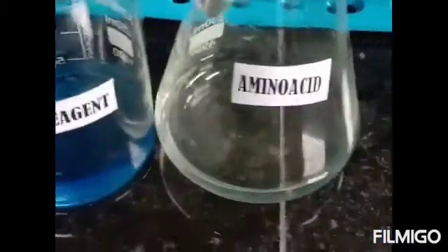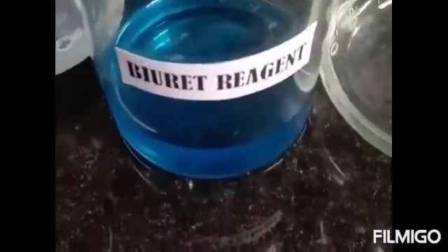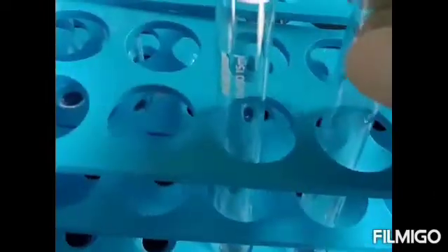We have taken 1 percentage protein and 1 percentage amino acid. Protein obviously gives a positive Biuret test, while amino acid is taken as a negative control. Amino acid does not give a positive Biuret test.